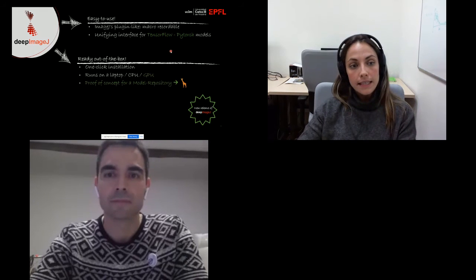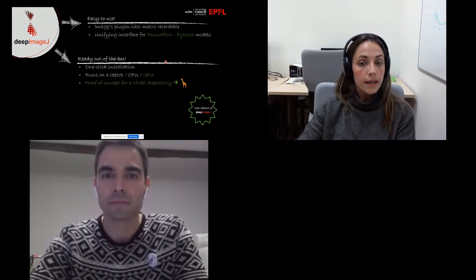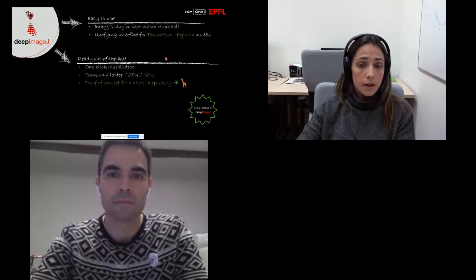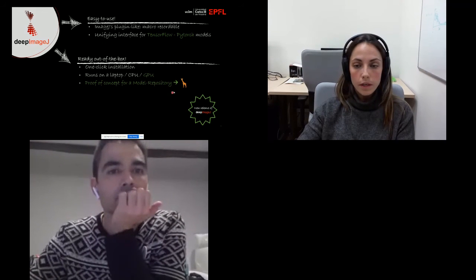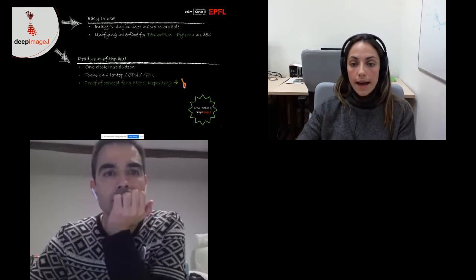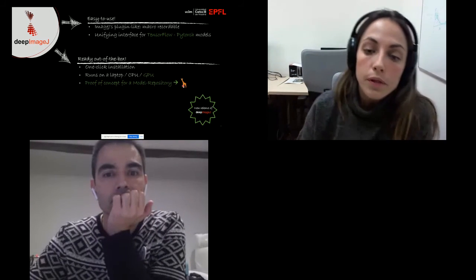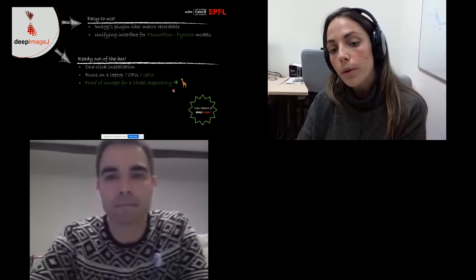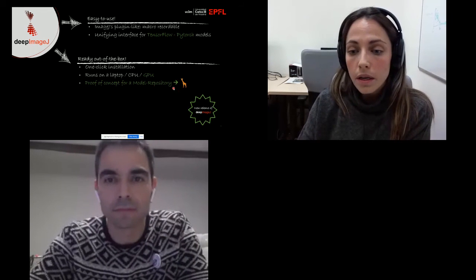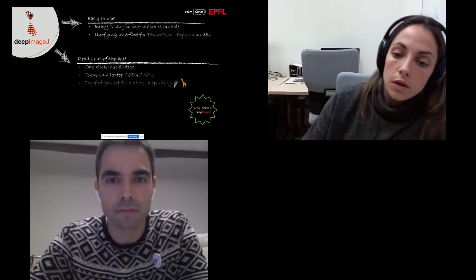The second thing that is nice about DeepImageJ is that it's really out of the box. It's just one-click installation to get it, as with any other plugin, but also for the models. It runs on the laptop, on a CPU, or on a GPU. There's also a GPU connection available for TensorFlow. And when we started this, it was kind of a proof of concept because we wanted to build a model repository. So as a developer, I train a nice model to perform a specific task, such as, I don't know, segmentation or some denoising.